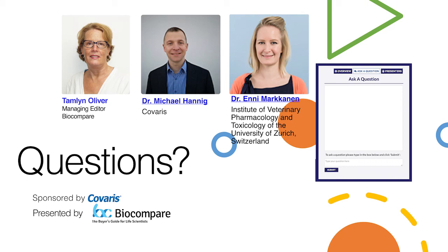Other than that, honestly, maybe no direct sunlight, but usually in any archive you don't even have windows, so I wouldn't expect sunlight to get into any archive that contains tissue samples. So really, in quotation marks, normal circumstances should do.